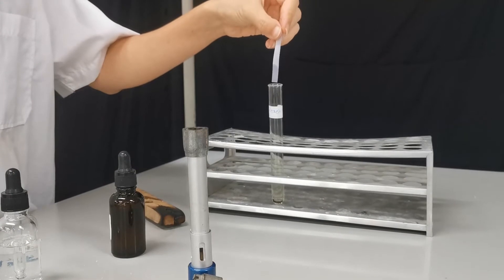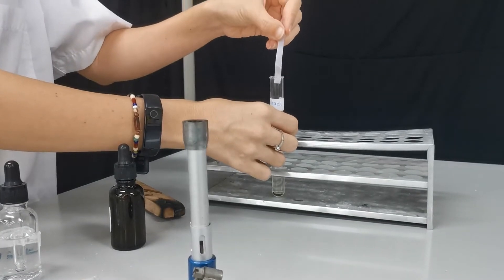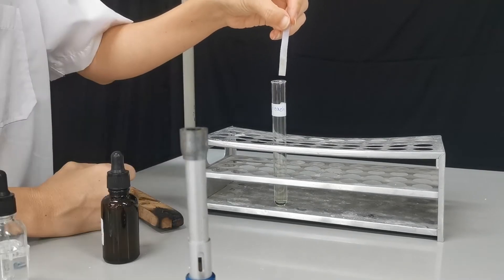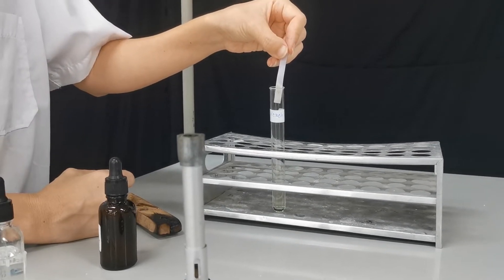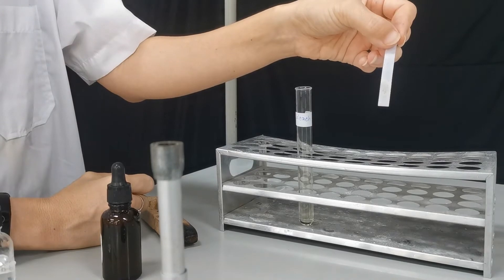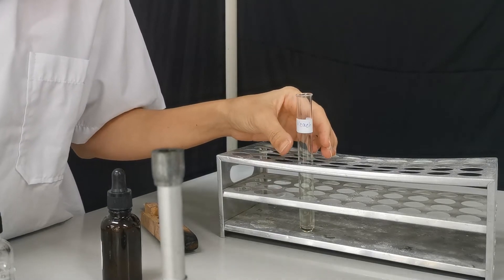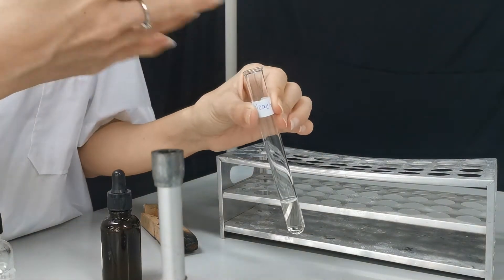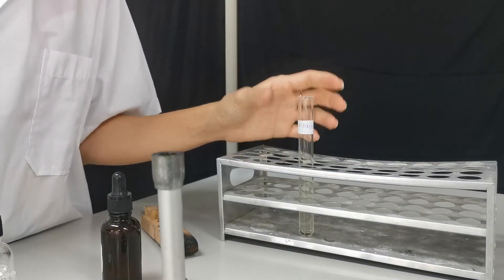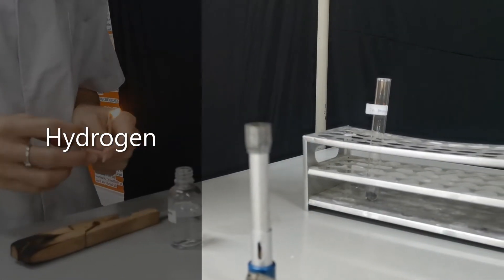We put the blue litmus paper at the tip, and you can see that the blue color turns white — this means that the gas bleaches the litmus paper, and that is the test for chlorine gas. If you smell it by wafting it under your nose, you can also smell that characteristic swimming pool smell. The next test we're going to do is a test for hydrogen gas.